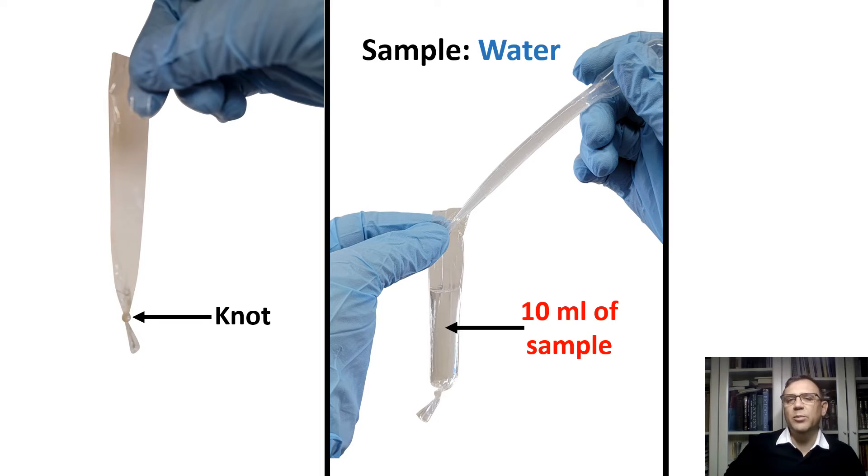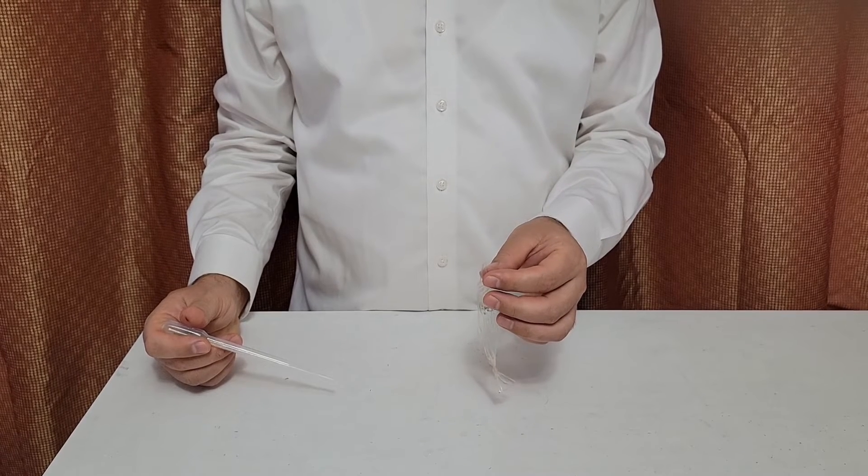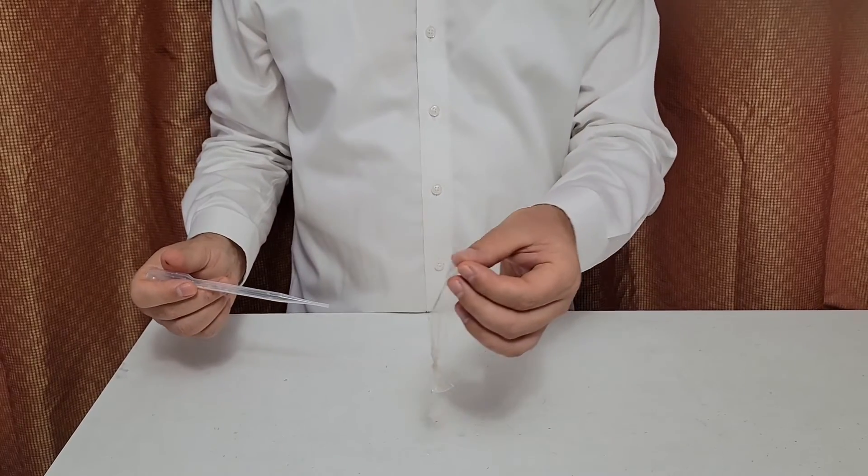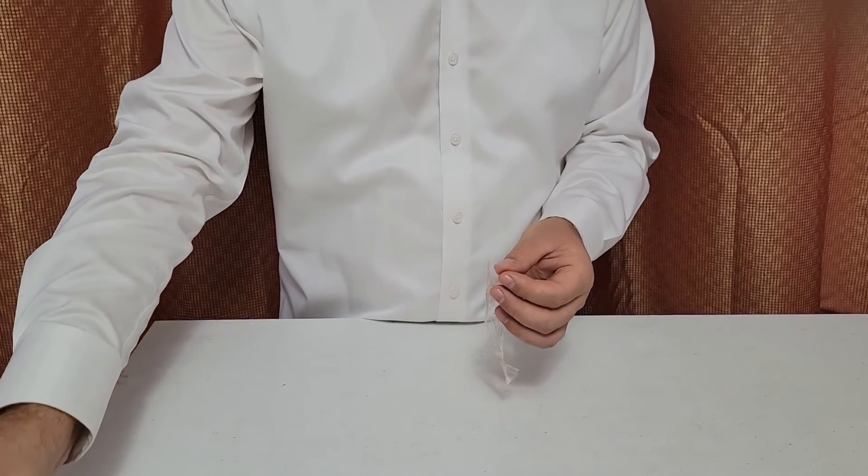Once the bag is open, you can add your first sample using a plastic 3 ml dropper or by pouring in 10 ml at once from a graduated cylinder. In our case, the sample is tap water. After adding the sample, we will secure the end with a string. And here's how I do this.